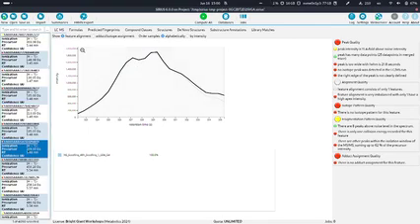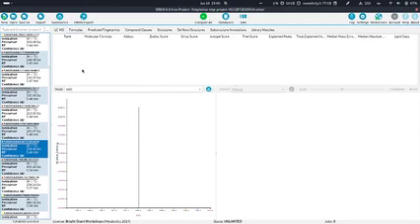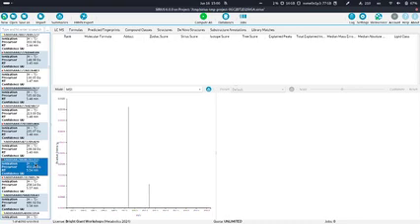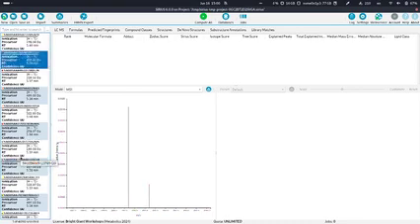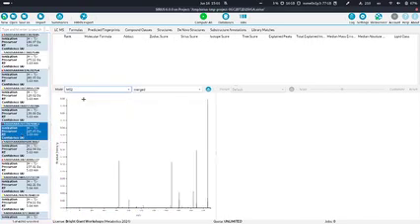Okay. Now that we have seen everything, at least without computing something, maybe one thing we can look at before we do computations is that in the formula screen you can already look at your spectra. So you can look at the MS1 spectrum, for example. Often you will see the isotope pattern here, or you can see some adducts, for example. You can also look at the MS2 spectrum or spectra.